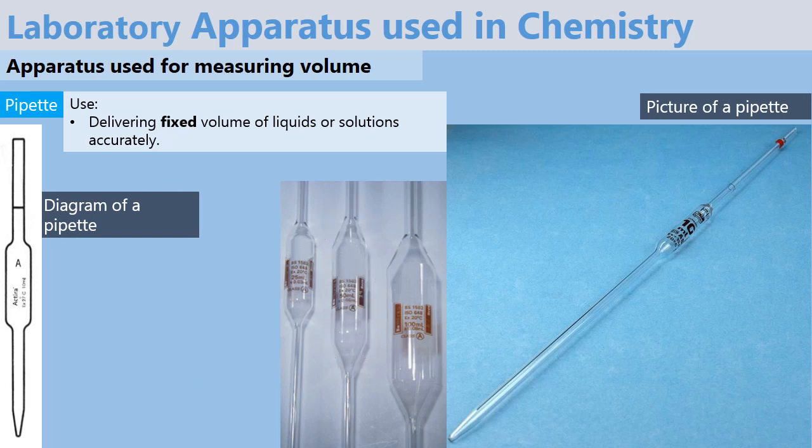And finally, we have this one here that shows a pipette that measures exactly 100 milliliters. These apparatus that measure accurate volume usually do so at a certain temperature. I hope you can see, but if you zoom in to this part, you'll find that we have a temperature of 20 degrees Celsius indicated. That means these pipettes measure accurately at 20 degrees Celsius, usually about room temperature.